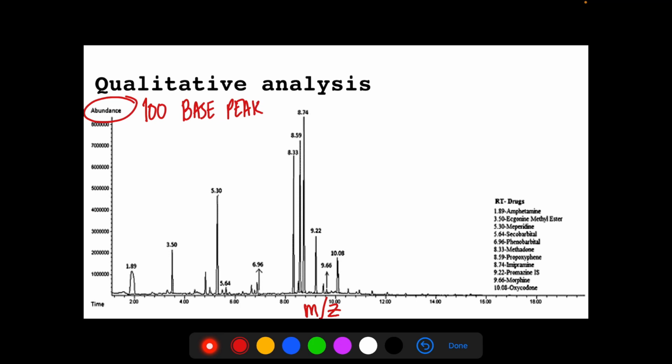We are lucky because modern mass spectrometers can already resolve ions differing by only a single atomic mass unit, so they can provide accurate values for the molecular mass of a compound. The highest mass ion in a spectrum is normally considered to be the molecular ion.